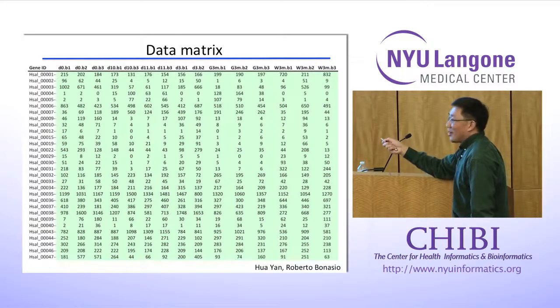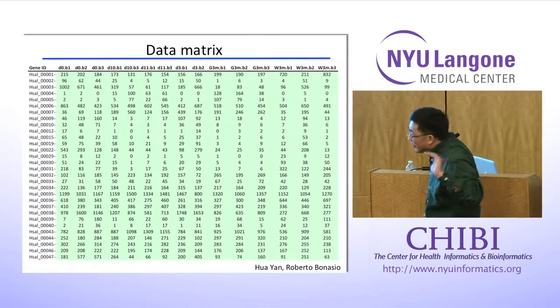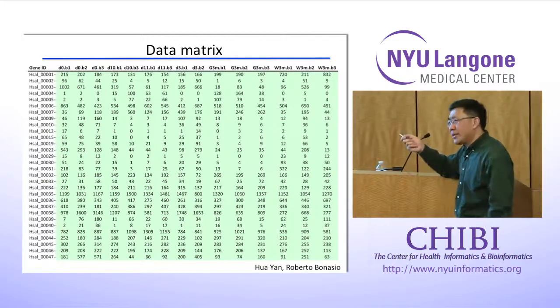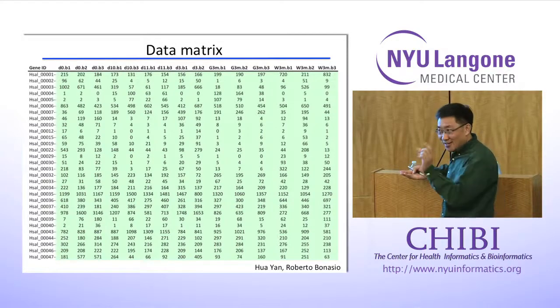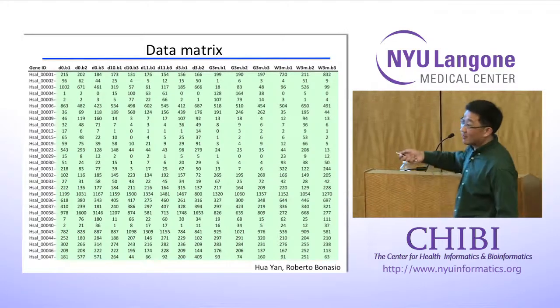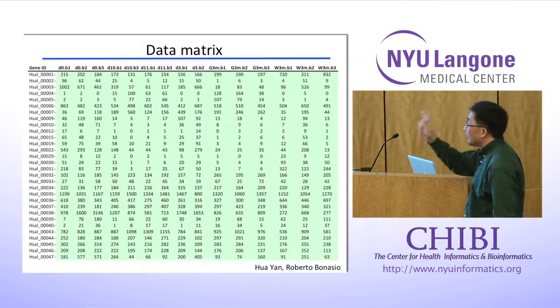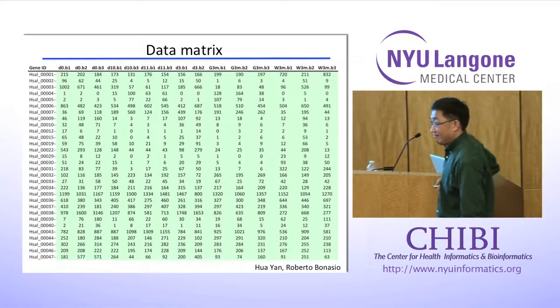In your formula, you do this calculation. If you put the gene length adjustment in, the length of that gene will be a denominator of the two sides of that equation. Sooner or later, that denominator will be removed. Why do that at the beginning? So gene length adjustment for differential gene expression is totally unnecessary. Okay?